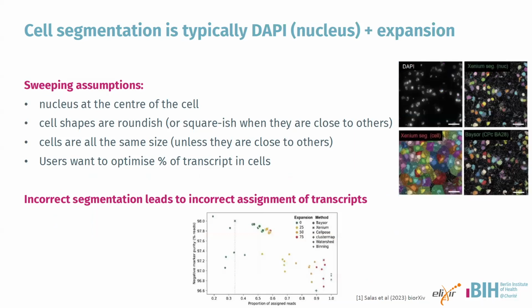In a study with Mats Nilsson's group, one of the things we found was that the approach typically taken in the original Xenium cell segmentation was pretty poor. So they would take this DAPI stain, use an algorithm to identify the nuclei, and then perform a uniform expansion to find the cell borders. So if you had a cell by itself, it would be practically a round cell. The expansion is pretty big. The default was 15 microns.